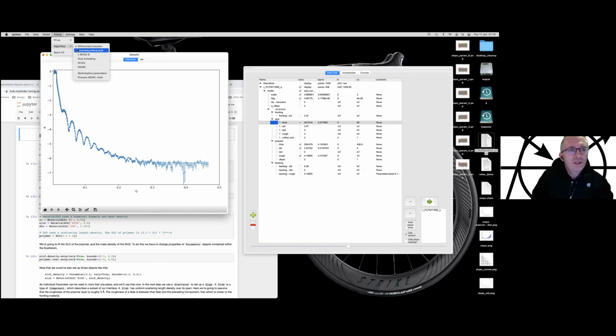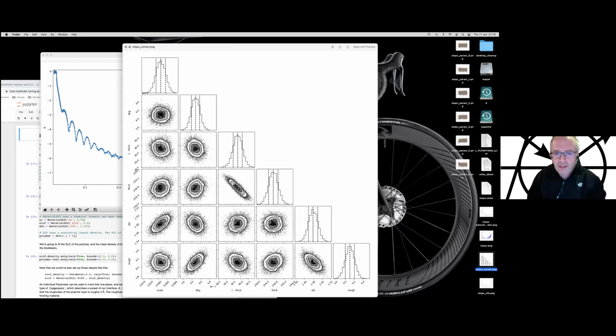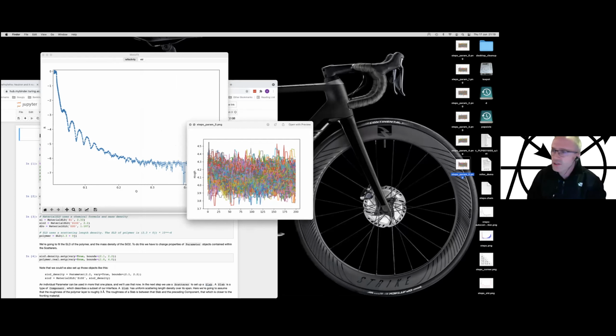You can also, with the GUI, use various different algorithms, including Markov chain Monte Carlo with MC. The output from MC is down here. You can get out the correlation matrix. This is one I prepared earlier. You can see the correlation here. You also get out all the chains and the parameter values as you do a different number of steps. There you go, I'll stop there.